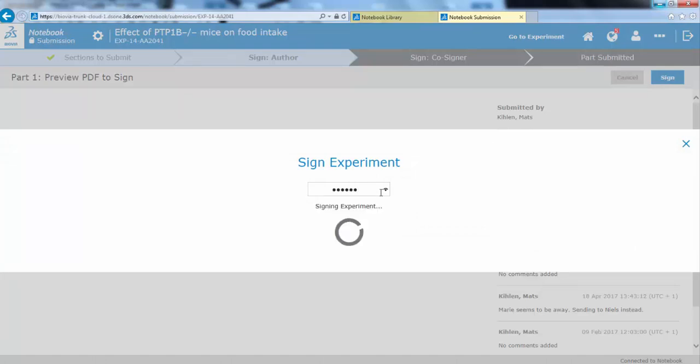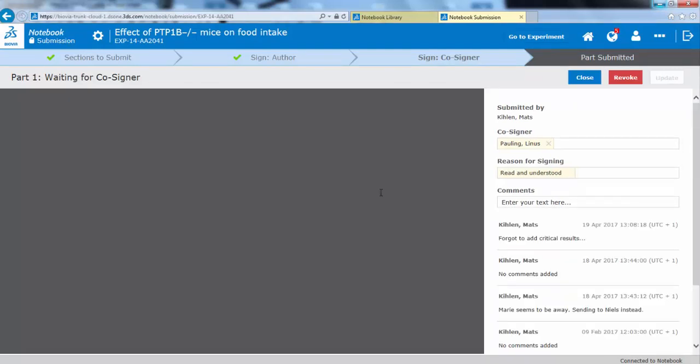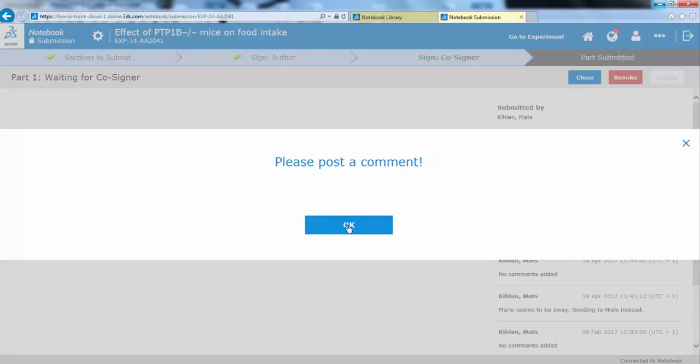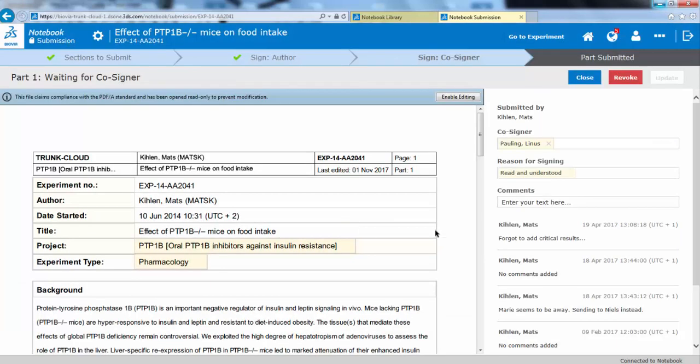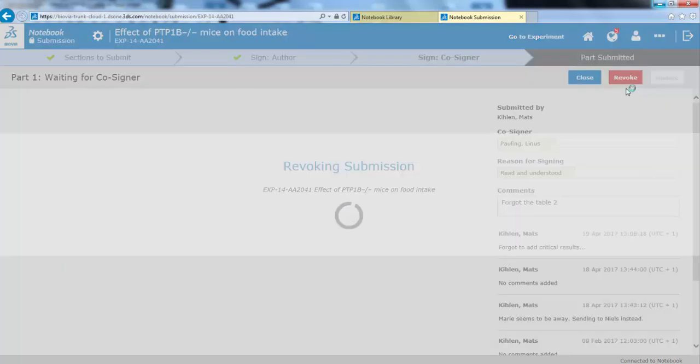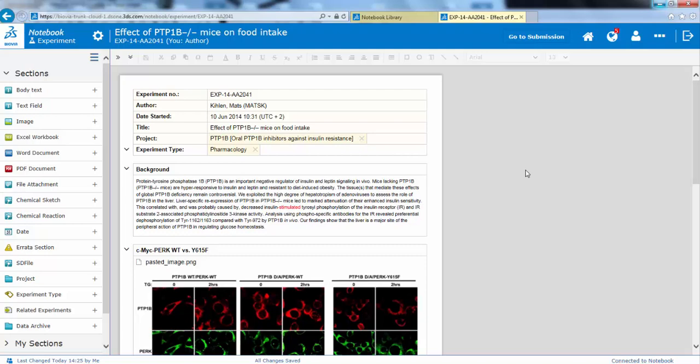If it's an experiment assigned to a project that needs witnessing, then the witness will pick this up on their first page upon login. From this view, you can also revoke the submission if you've forgotten something or done something wrong, and in this case you need to post a comment as before. And from this view, I can always go back to the experiment.